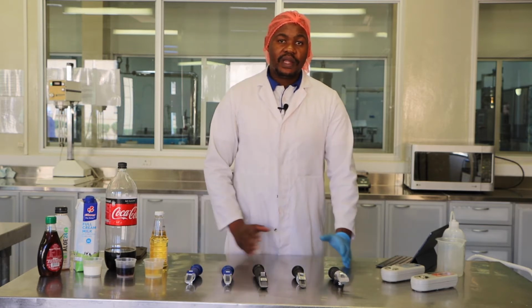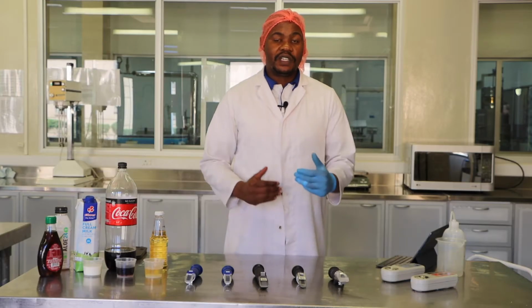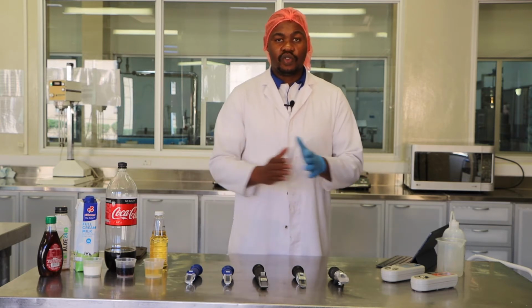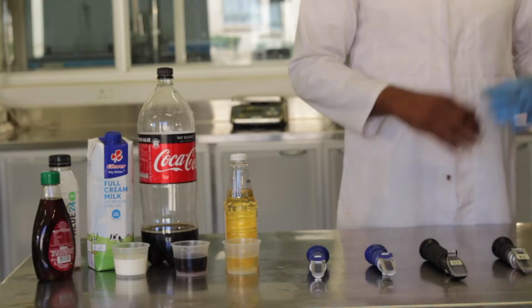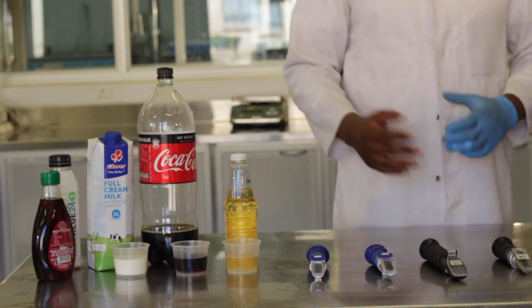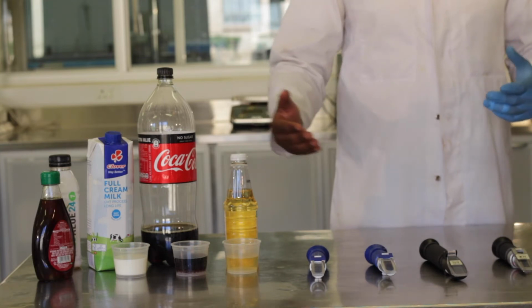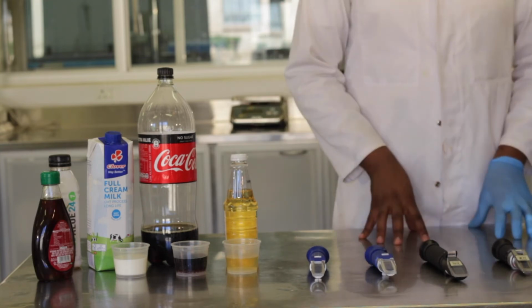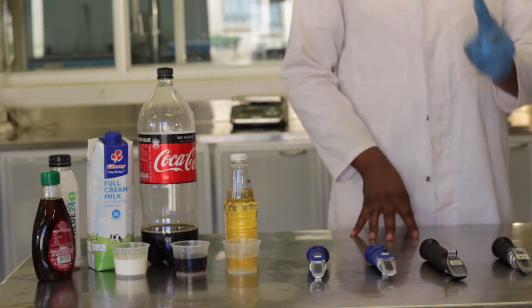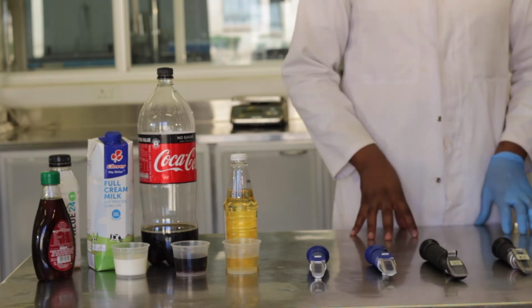Now in this scale of 0 to 100, we can have different ranges. One refractometer would have a range of 0 to 32, another would have a range of 43 to 64, another would have 0 to 50, and another would have a scale of 52 to 96. So every time you have a refractometer, you need to check first what is the scale. And number two, you also need to establish what type of refractometer you have.